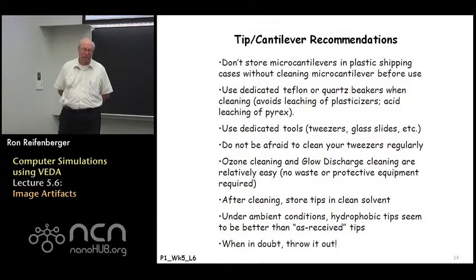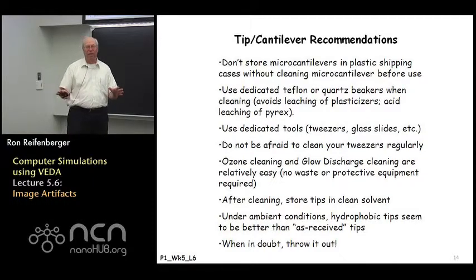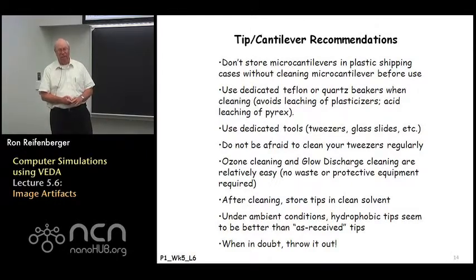And so then lastly, the rule of thumb we always follow is, when in doubt, throw it out. We don't want to spend a lot of time trying to analyze data that may be taken with a contaminated tip or with a broken tip. So if there's any doubt about it, just start over again, get a new tip, because the worst thing that can happen is you'll have some data, and 2 or 3 months after the data's been acquired, you'll forget about the state of the tip, and you'll sit there and spend hours of your life trying to understand data that perhaps is not worthwhile understanding. So that's one of the rules we encourage new students to follow as a common protocol in the lab.